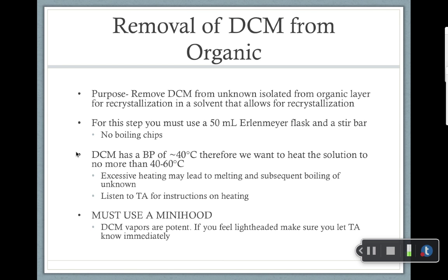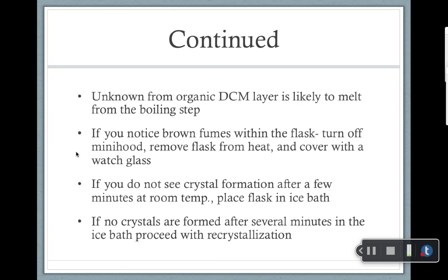One other important thing is that we're going to be using mini hoods. The DCM vapors are potent, so we need to pull out as many of those vapors as possible. Because we are limited in our hood space, this can be overwhelming for some. So if you begin to feel lightheaded, make sure you let your TA know immediately.